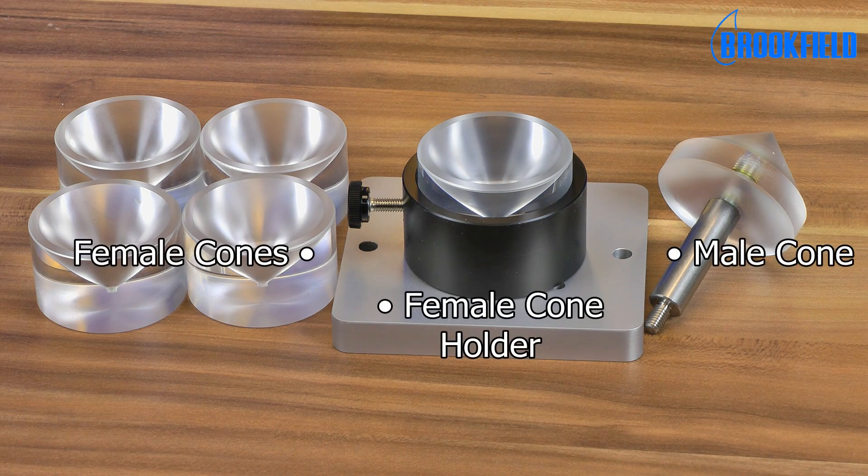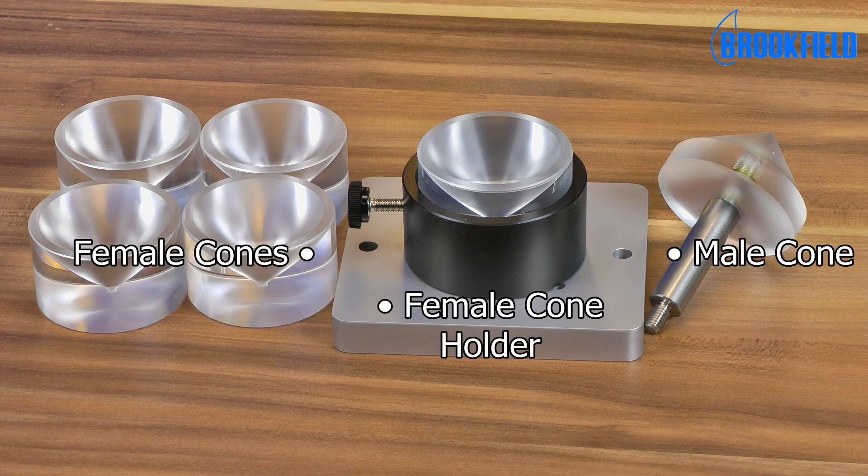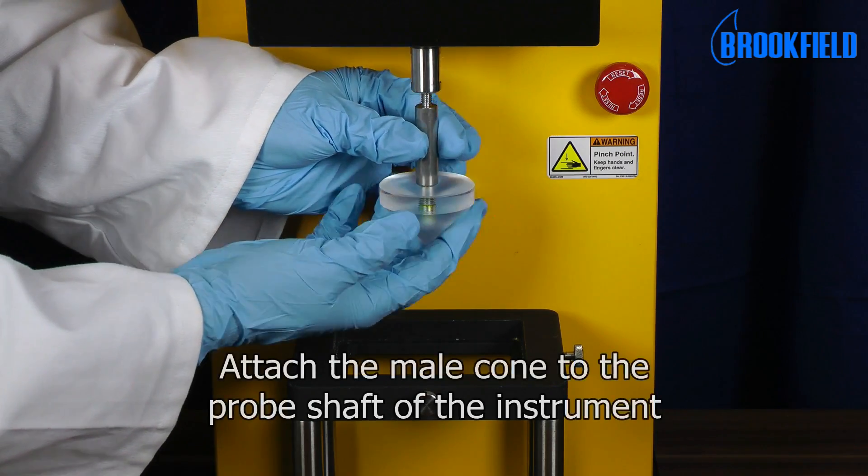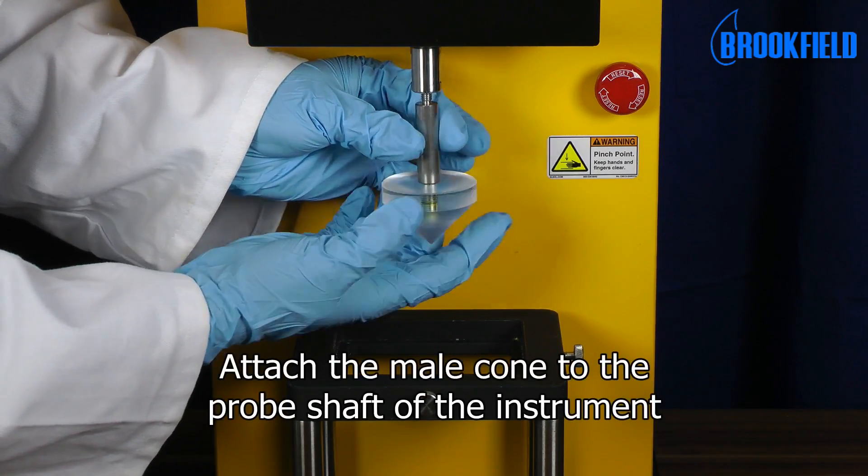Here you see the individual parts of the fixture. To set up the test, attach the male cone to the probe shaft of the instrument.